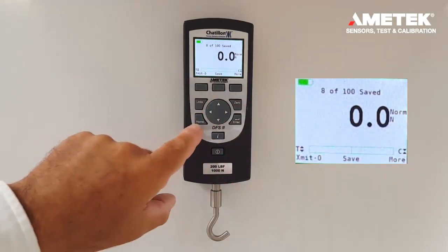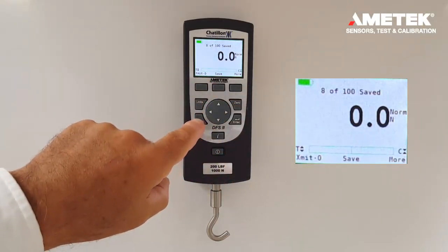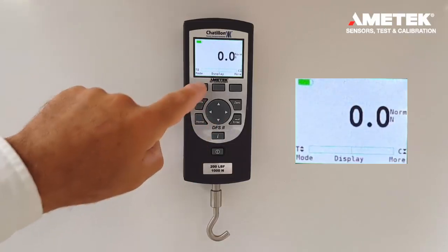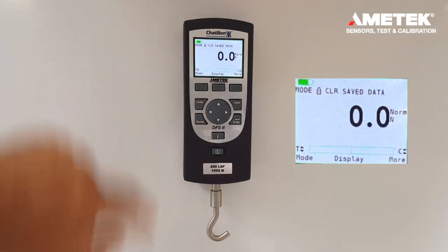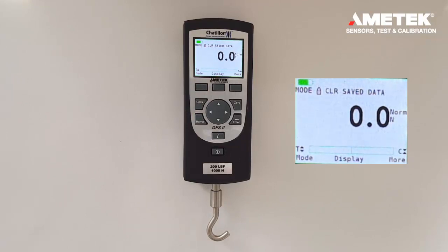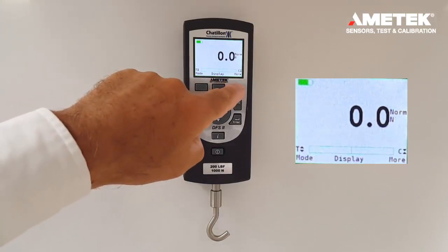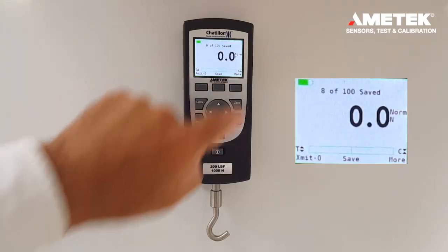At this point, if the mode needs to be changed, we could press the home button and then the mode button. But because we have saved data, we cannot change the mode.